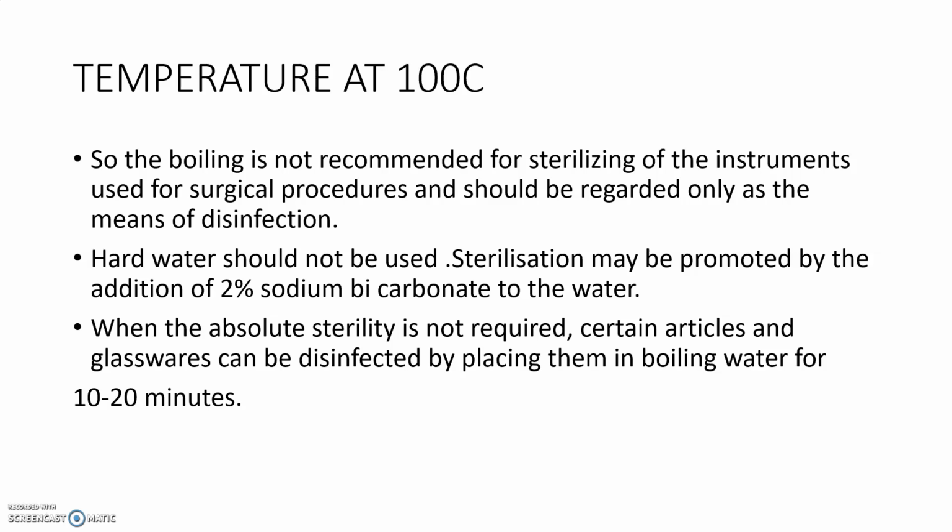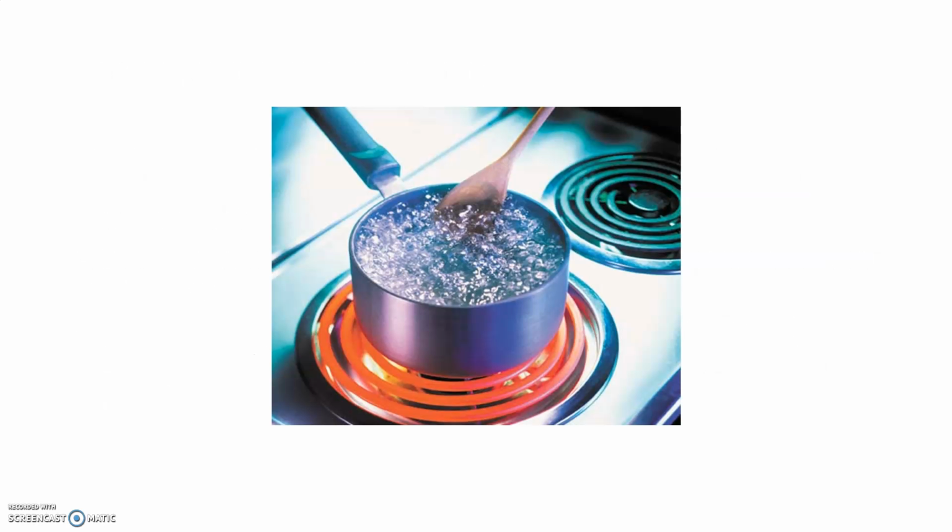So one point which we have repeated: when absolute sterility is not required, certain articles and glasswares can be disinfected by placing them in the boiling water for 10 to 20 minutes. This is the picture of boiling.